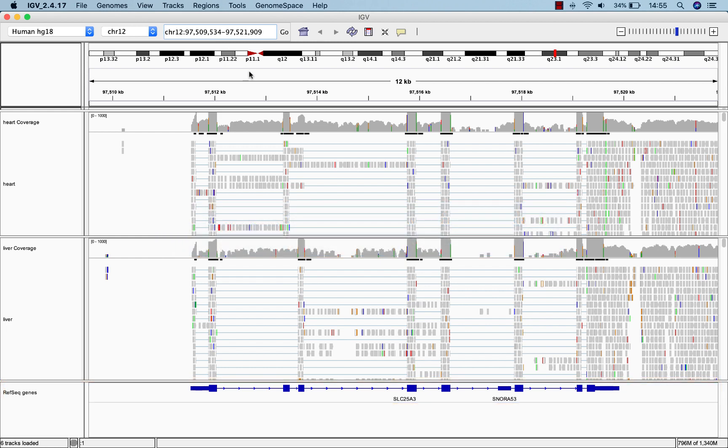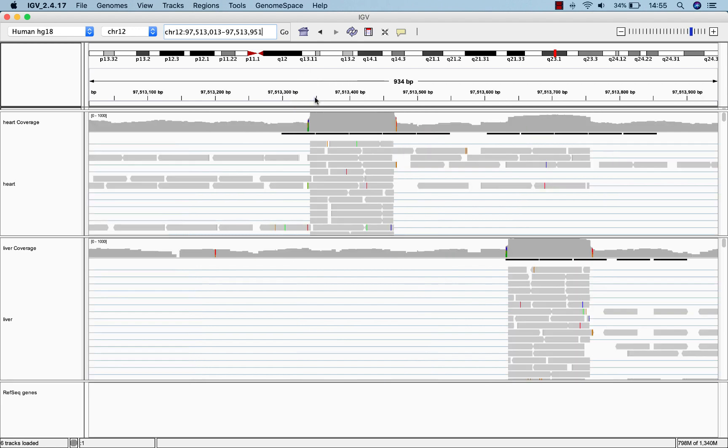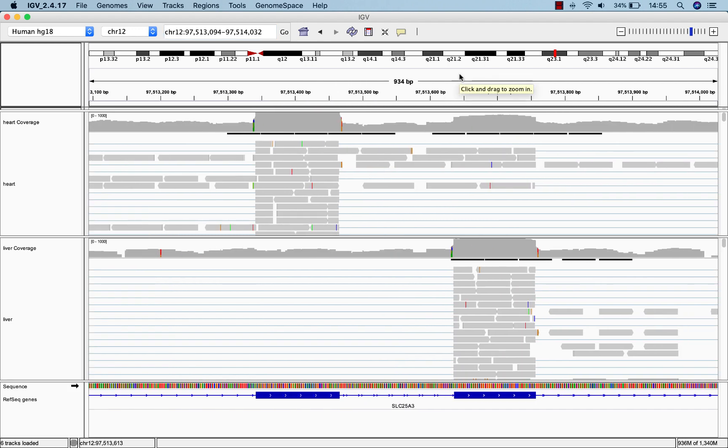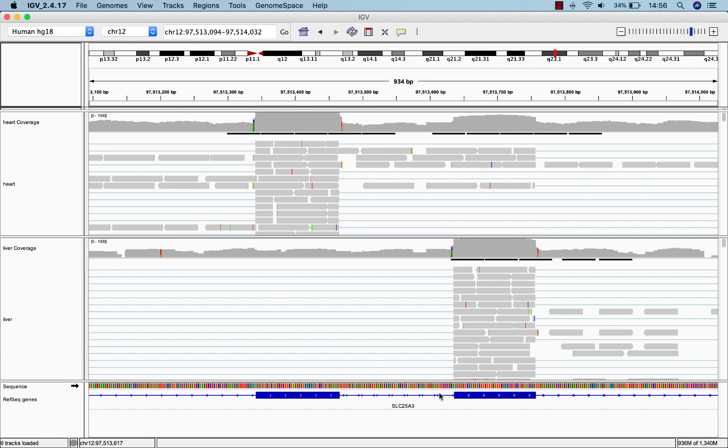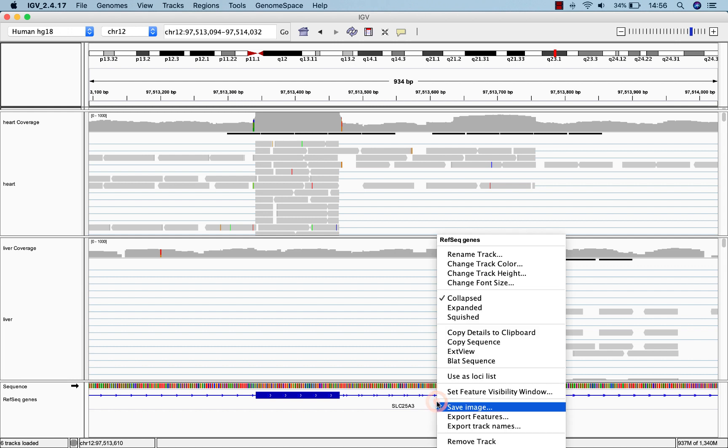Zooming into the third and fourth exon of this gene, we see something interesting. The coverage and alignment tracks look quite different between the tissues. Liver has high coverage of the exon on the right, whereas heart has high coverage of the exon on the left. If we expand the gene annotation track, we can see why.